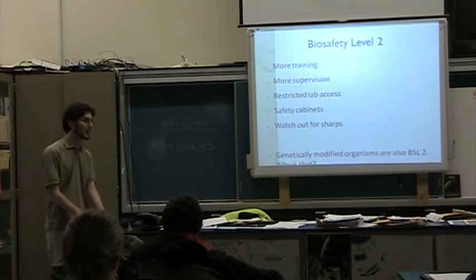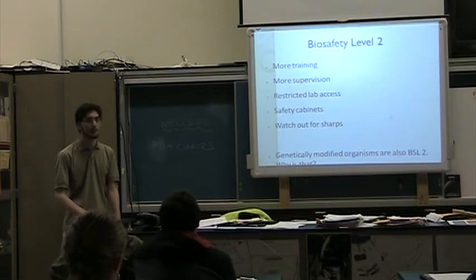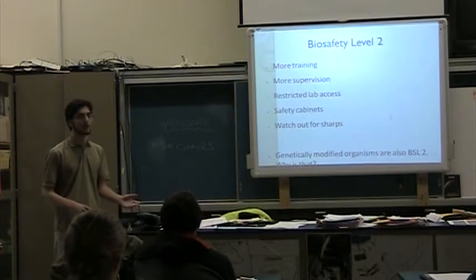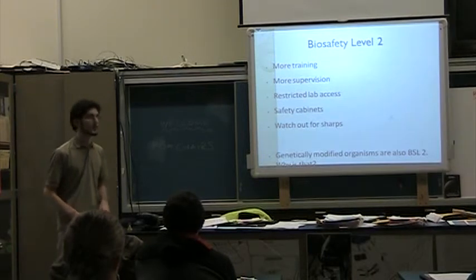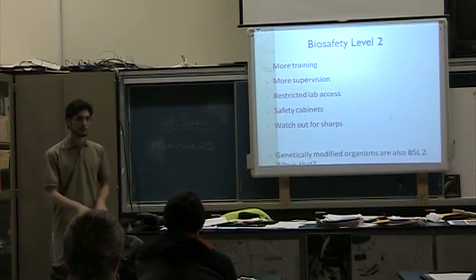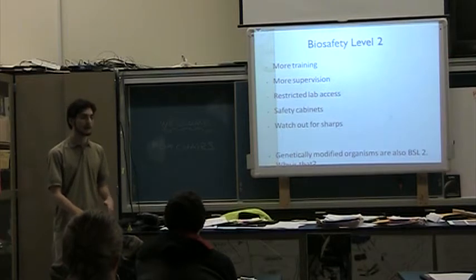This requires more training when you have a facility with level 2 pathogens. We need more supervision, more experienced people making sure that we're following the procedures correctly. It has restricted lab access, so anytime people are working with pathogens in a laboratory, there is no public access.